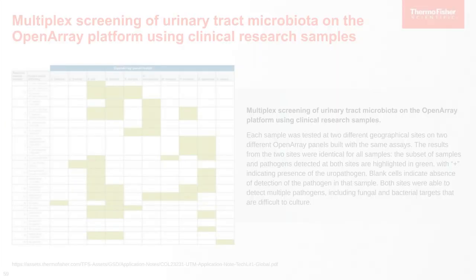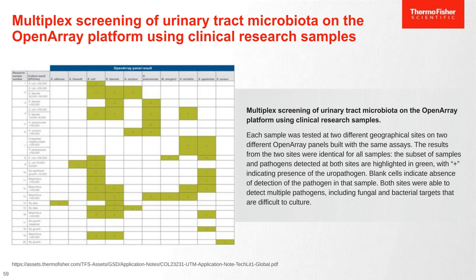And then finally, here we're looking again at different targets, with culture versus the open array results. And you can see, again, how it compares against the culture. So equivalent or more sensitive results.